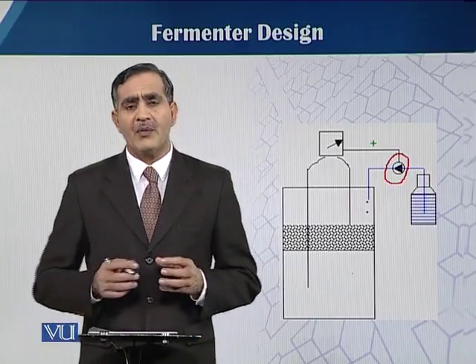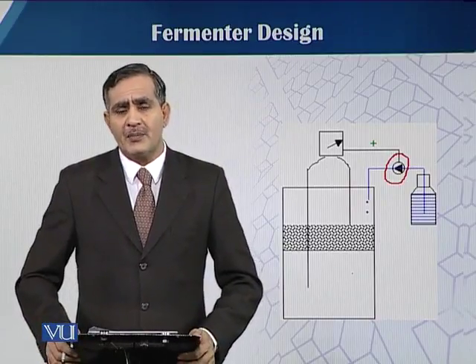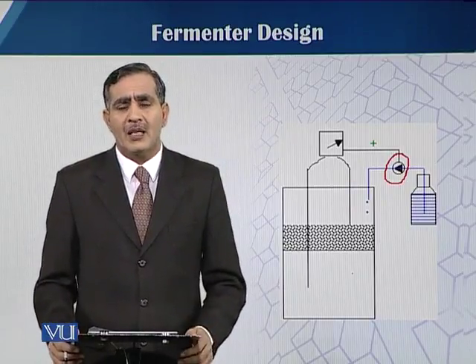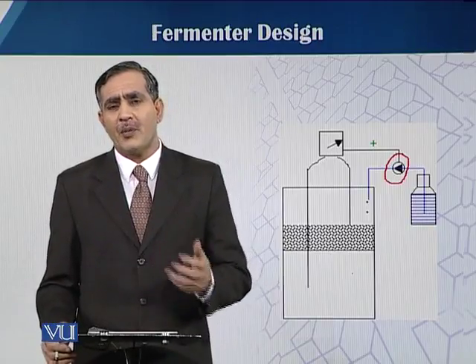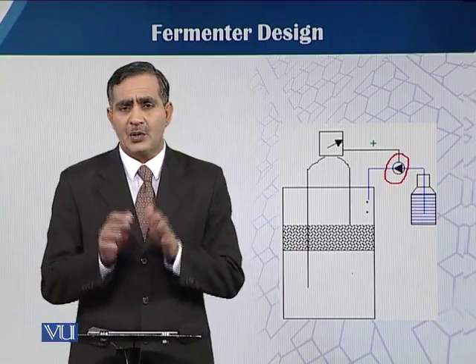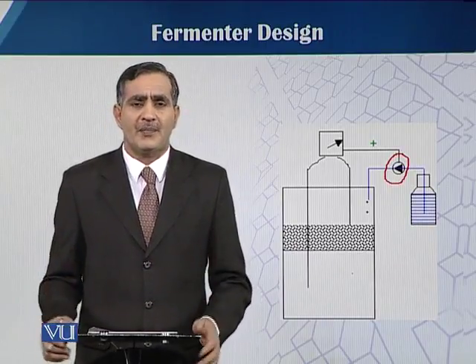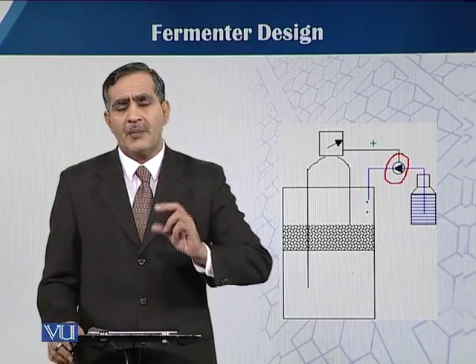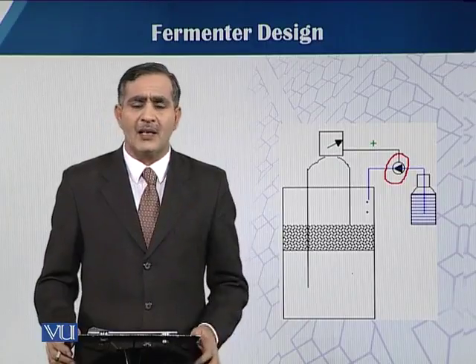But when we use this wet-on and wet-off system or level probe, sometimes in a fermentation there is a practical problem, because the whole fermentation process is aqueous. Sometimes vapors are produced and those vapors touch the upper level probe.